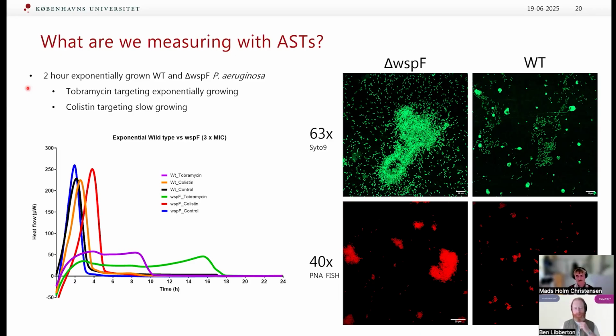Cool. I have a question. I think it was super interesting when you showed, like the whole premise of the talk is about making better decisions in the clinic and really moving away from broad spectrum antibiotics as soon as possible when you have the data that you need to use a different treatment. And obviously the timings are much less, and so you can make decisions early.